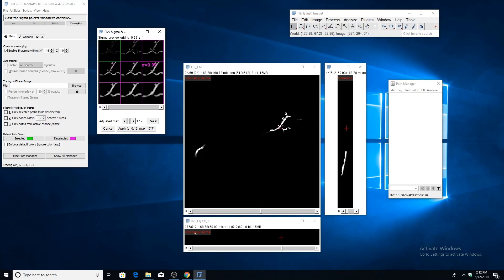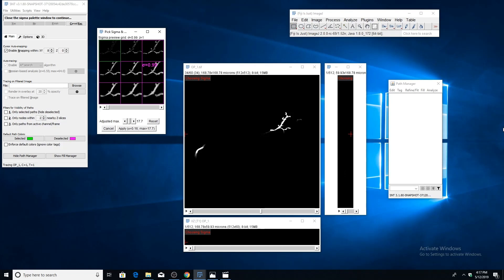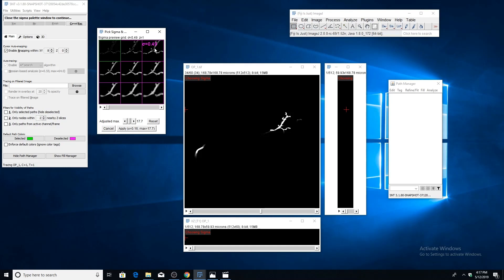A larger value of Sigma will act as a low-pass filter and will only consider larger scale structure. A smaller value of Sigma is more sensitive to local shape characteristics but is also more sensitive to noise. It's generally safe to choose a value somewhere near the middle.